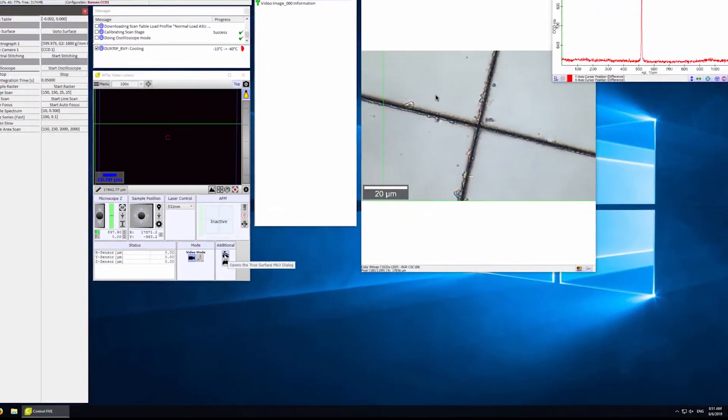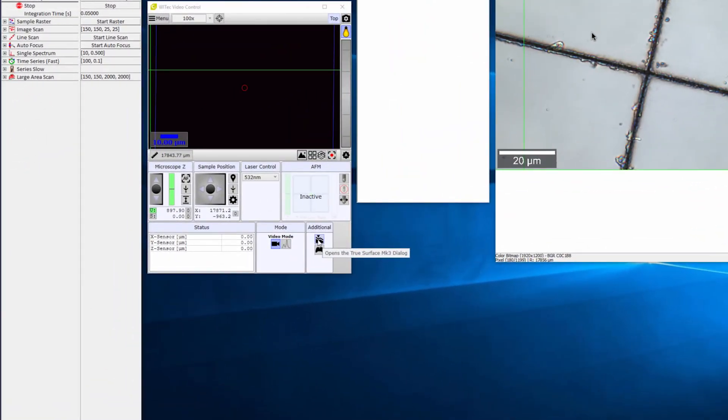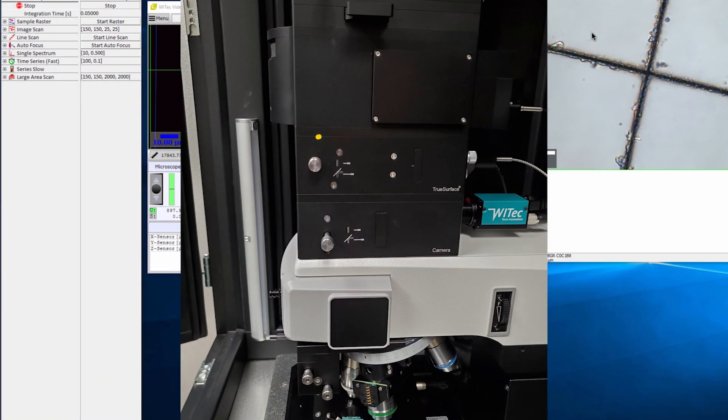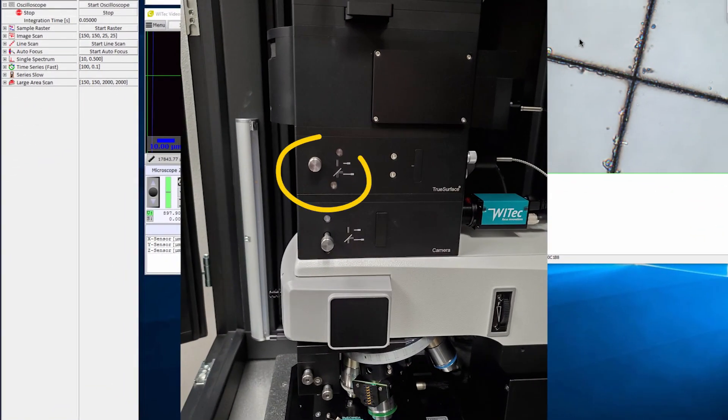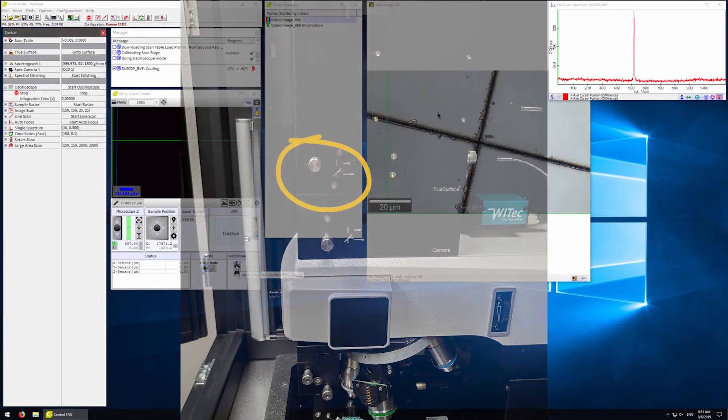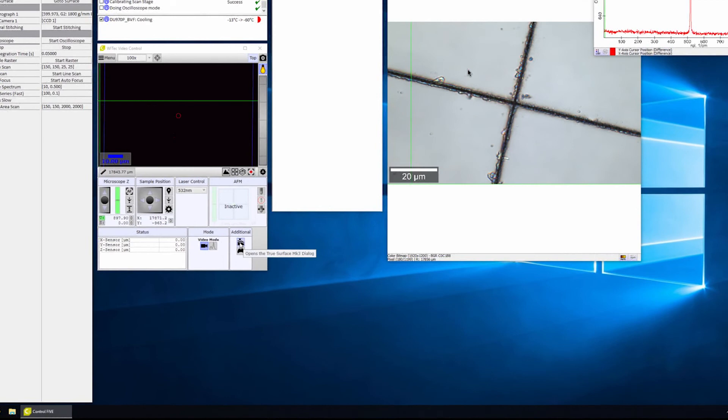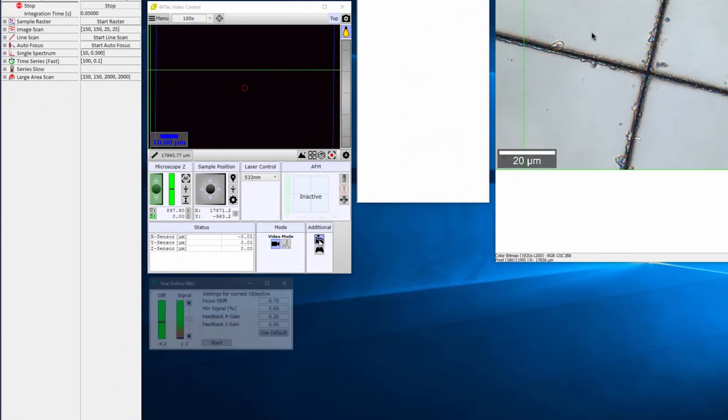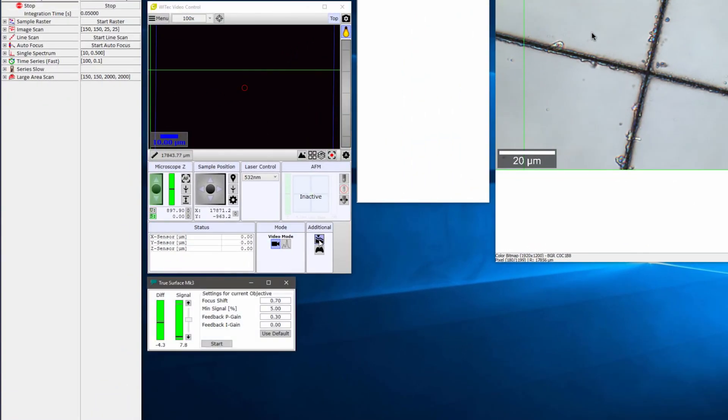Let's now try an option called TrueSurface. In order to use the TrueSurface option, we first have to pull the knob for the TrueSurface optics to be in place. To start TrueSurface, we click on the icon right above the controller icon. It opens a new pop-up window, then we can click start.